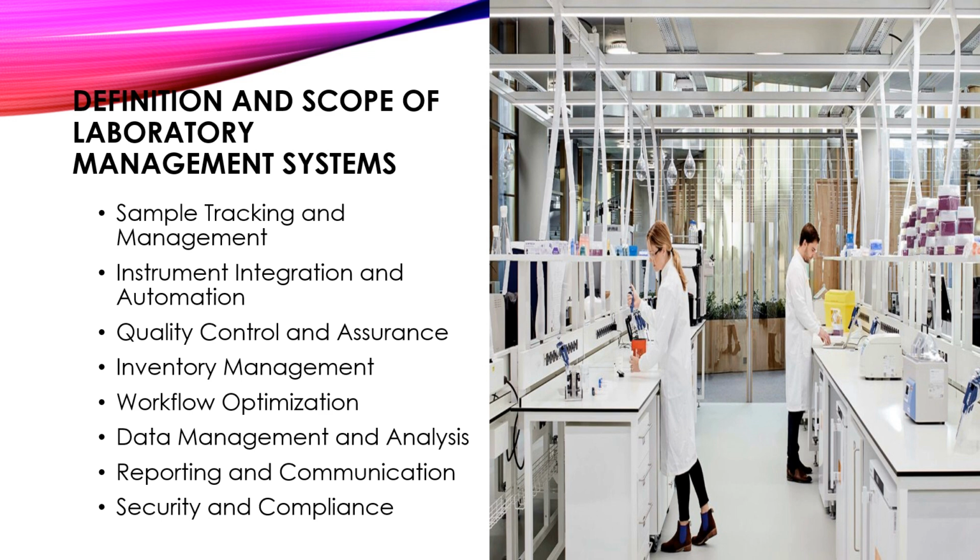Definition and scope of laboratory management systems. Now, a laboratory management system is a system designed to manage various administrative, operational, and data management tasks within a laboratory setting. Now, it encompasses a wide range of functionalities tailored to meet the specific needs of laboratories across different industries, including healthcare, pharmaceuticals, research, food, beverages, environmental, and more.